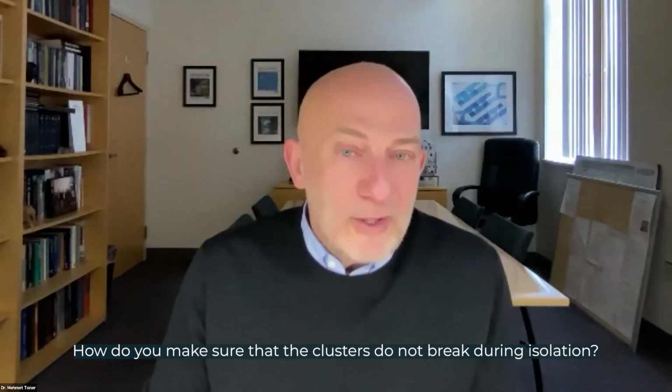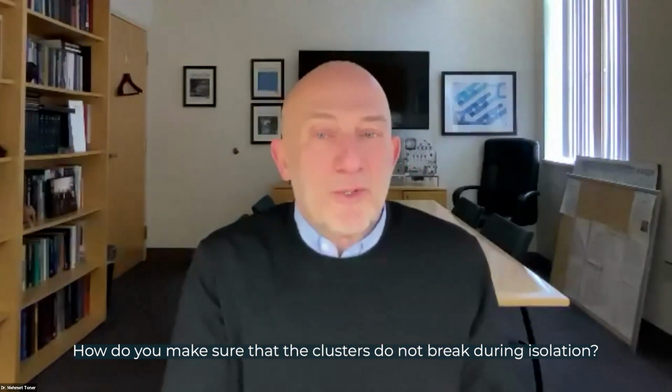It's hard to know for the real clusters because we don't know if we broke them into two small clusters or if there were two small clusters to start with. When we make artificial clusters and spike, we have published several papers where we can tell from the stickiness of the cells. Sometimes they're very sticky to each other and they don't go through a capillary. Capillary is only 7 micron, much smaller than the cluster.